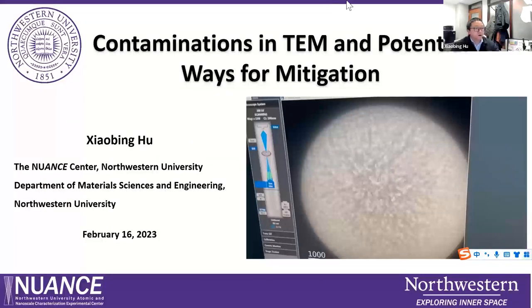I would like to introduce something about contamination. The title of my talk today is contamination in TEM and the potential ways for mitigation. Contamination is a problem for both TEM and SEM, but particularly for TEM, this problem is a headache for every microscopist because it will significantly reduce your image quality and affect almost all the imaging and spectroscopy you are doing.